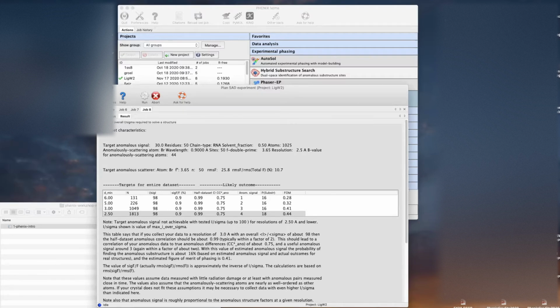There's a temptation to try and get the highest resolution by putting a lot of photons through your crystal, but of course that will damage the crystal. So when you're doing the phasing, you want to resist that temptation and often put fewer photons through to get somewhat lower resolution, but minimize the radiation damage. So how to collect good data is a whole course or a whole workshop in itself. I imagine there are other people on the line who have ideas as well.